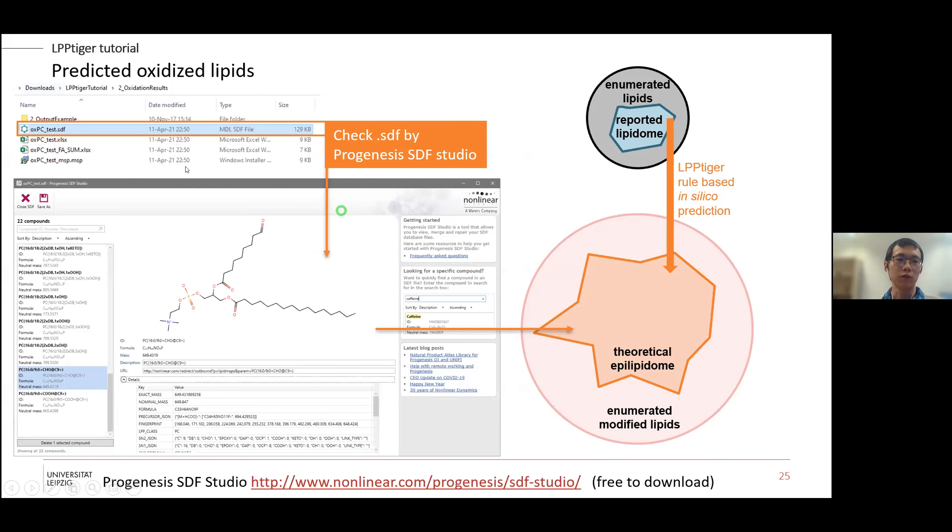For this step you will get four different outputs. The examples are in the second folder. The first one is called SDF format. You can download this tool, it is for free from ChemAxon. Then you can open this SDF file with ChemDraw or other SDF compatible software. You can see the predicted structures, the names, the m/z, the elemental composition, and additional information which we predicted.